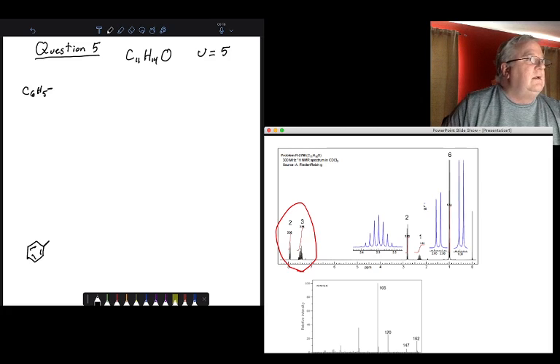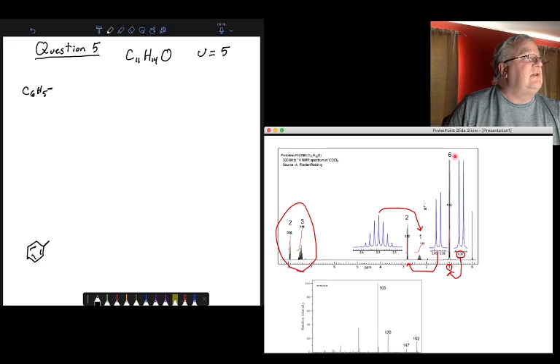Now I take a look at my NMR. It looks a little goofy because I have these black peaks and these blue peaks. If we take a look and we see that this is at one and this is at one, all this is is an expansion to show us the multiplicity or the splitting. We should be able to figure that out. Remember, we try to simplify.